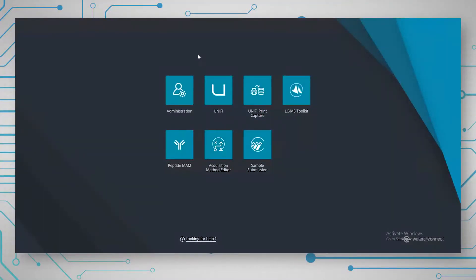What you can see here is the Waters Connect Hub. This is the new environment in which we have all the applications for things like Peptide MAM, sample submission, and acquisition method editor. We also have the UNIFI app, which contains all the functionality that we have in UNIFI. Today I'm going to show you the Peptide MAM complete workflow.